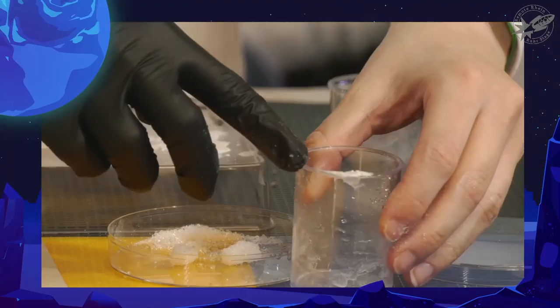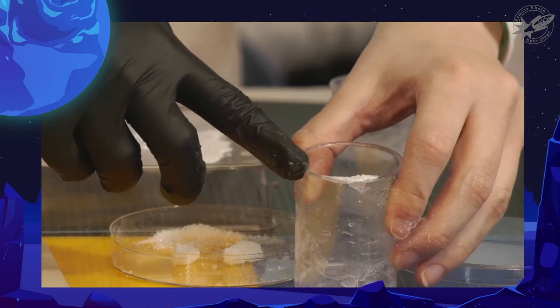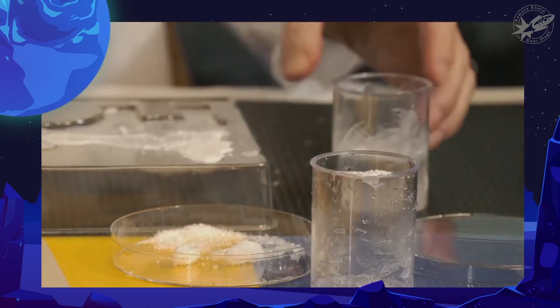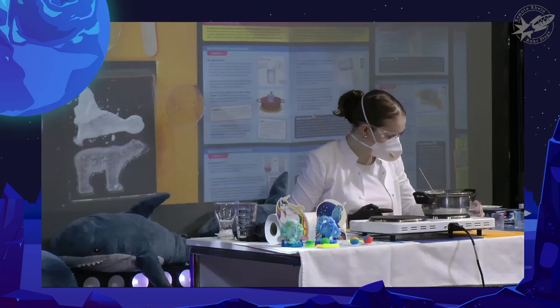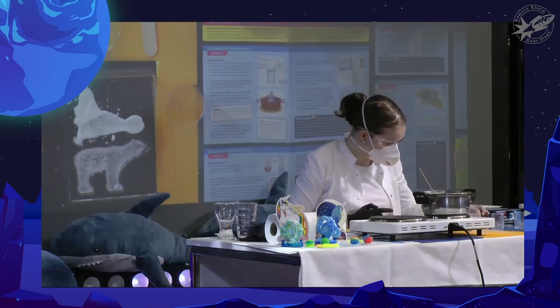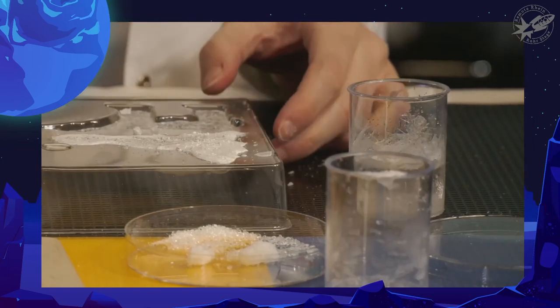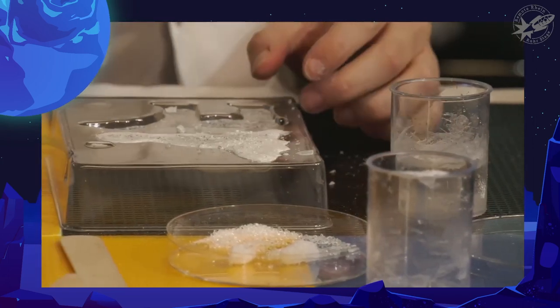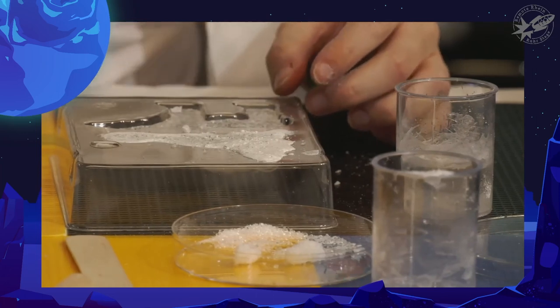Now that I've poured it out, you can also see a small crust on here. As soon as the liquid is gone, it starts to crystallize immediately. Here you can see that it's already formed a sort of surface plate.